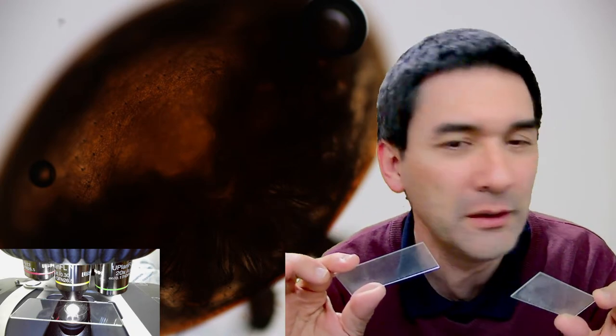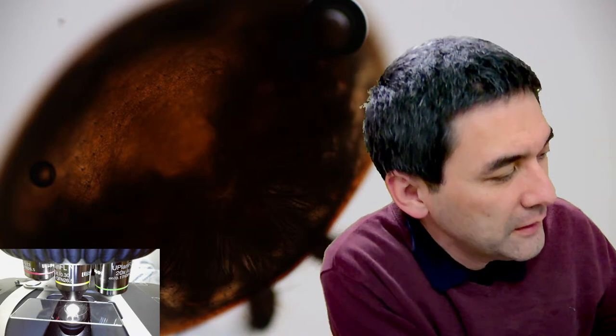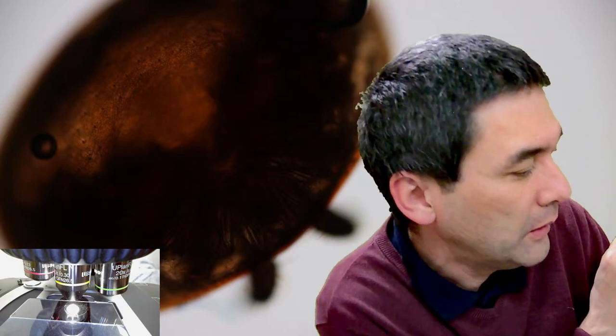Do you want to have a look at them under the microscope? I'll put them under the microscope, these are fresh slides, okay? I'm going to show you how they look under the microscope, so that you see how dirty they are. Okay, I need to close this a little bit and I have to refocus again. Look at this, isn't this cool? That's a blank slide. It's totally unusable. It's really fun. I can't believe it.